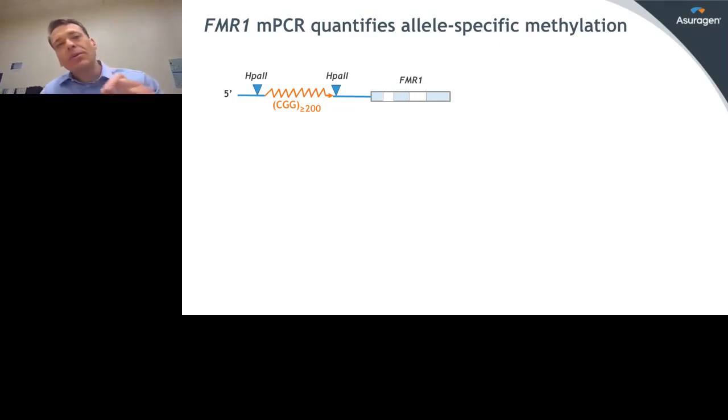So what I mentioned previously was that the ability to flag these large expansions can accommodate a great deal of the need for how you resolve molecular characterization of FMR1. And in fact, using this primary AmplideX PCR FMR1 reagent set, you can reduce the level of reflexing to, say, a southern blot for long expansions by 10 to 50-fold, but you can't completely eliminate it.